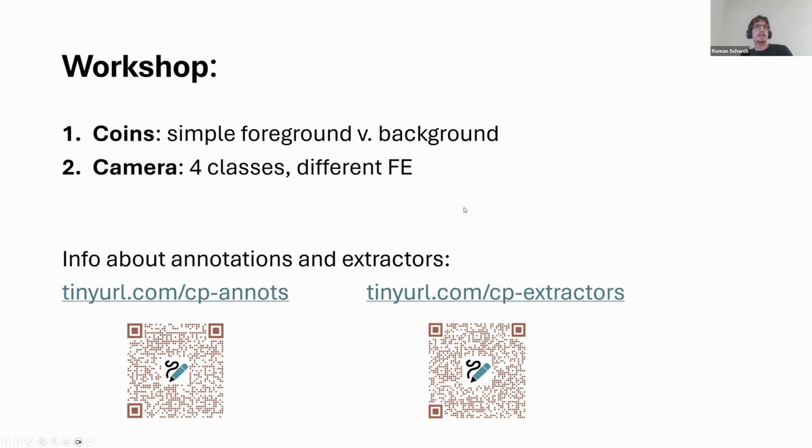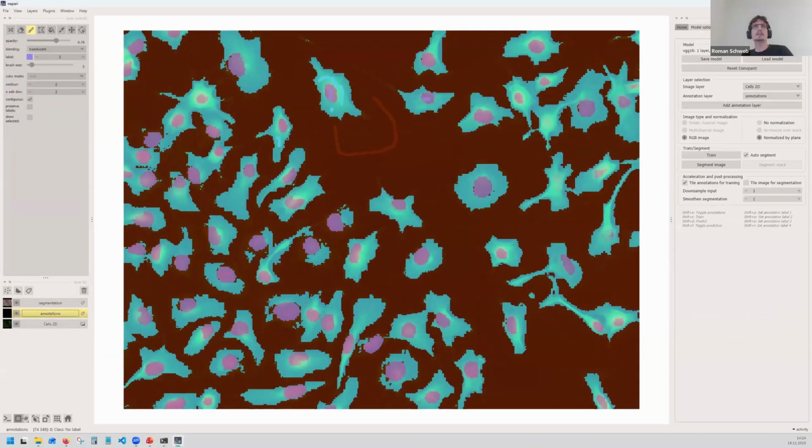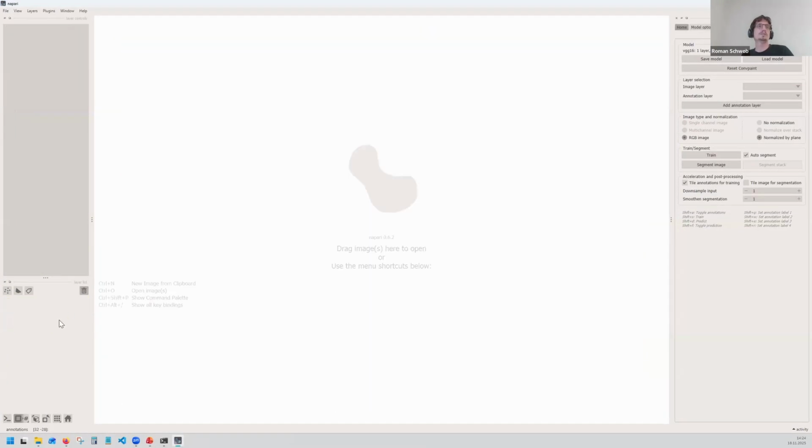So with this, I'd like to open Convpaint again. If you're ready for it, I would suggest that you try to follow along. If not, just pay attention and try to really follow what I'm doing just by watching.